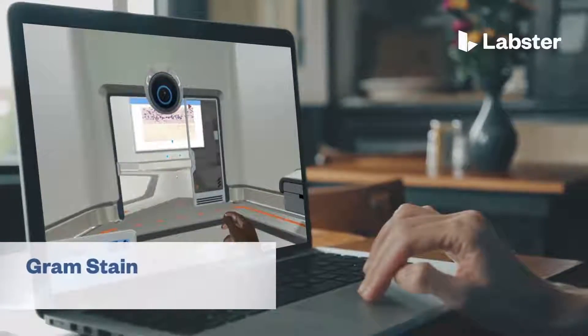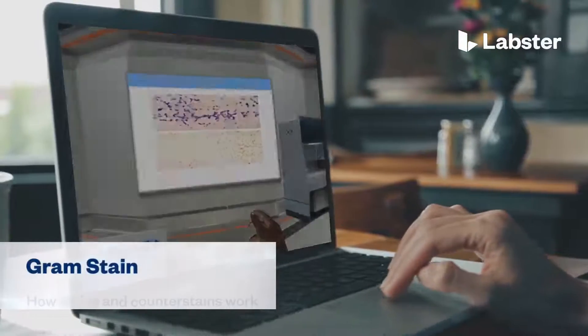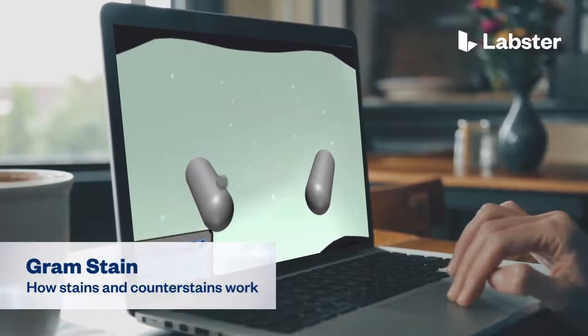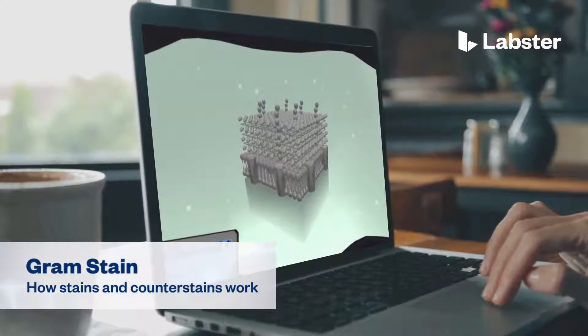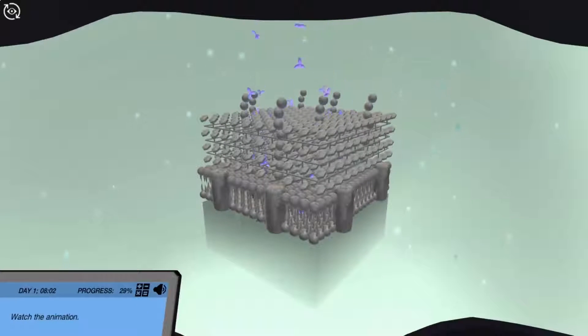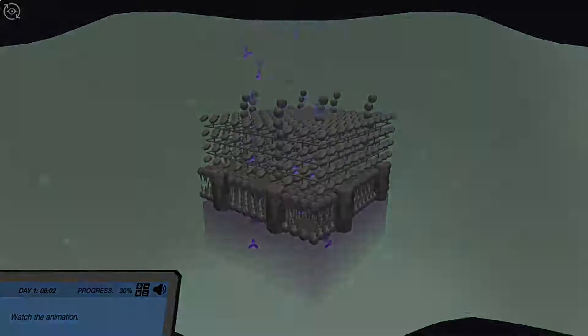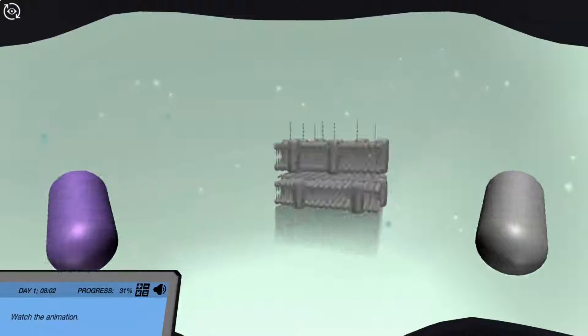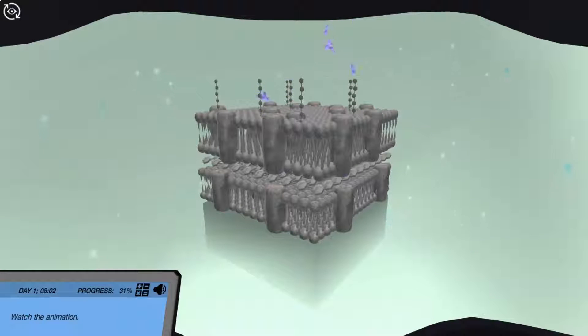In the Gram Stain: How Stains and Counterstains Work Virtual Lab, students step into a realistic lab experience where they can practice, learn, and explore science in an engaging and immersive way.